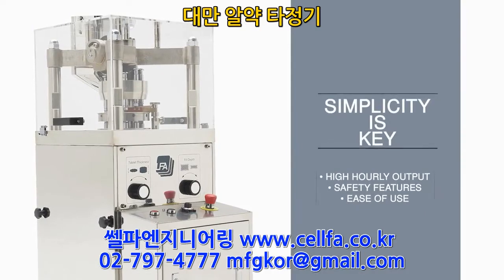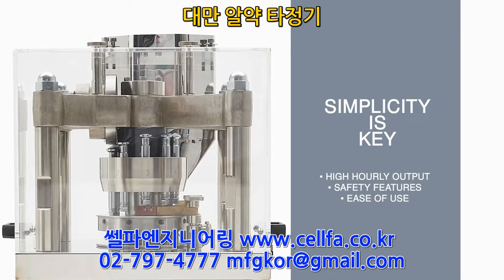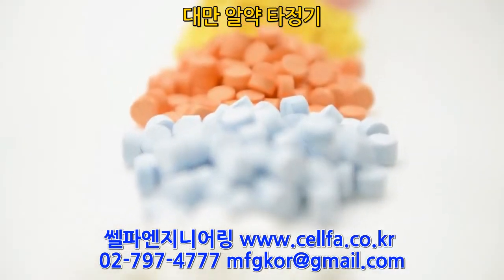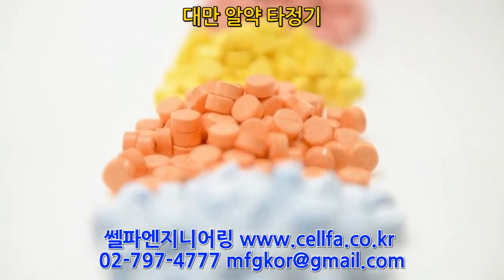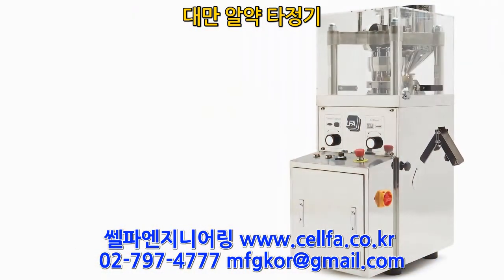Simplicity is key. With its high hourly output, safety, and ease of maintenance, the RTP-118 is perfect for anyone upgrading from a desktop tablet press. If producing tablets in high volume quickly and efficiently is your goal, then the RTP-118 is the perfect tablet press.